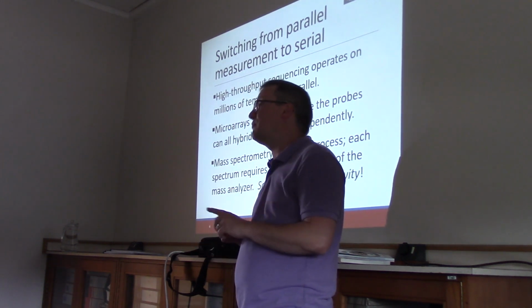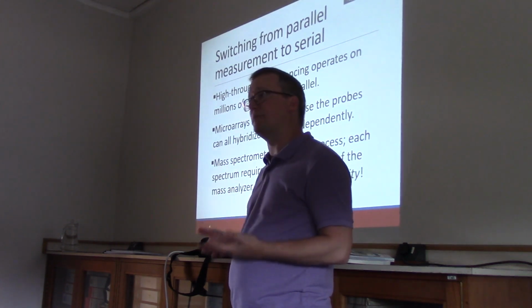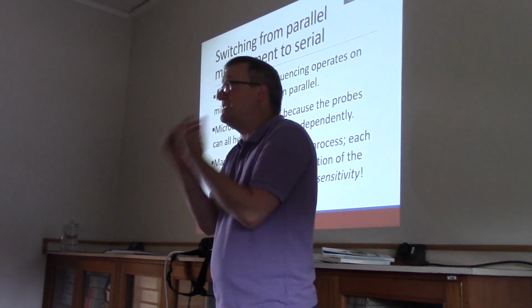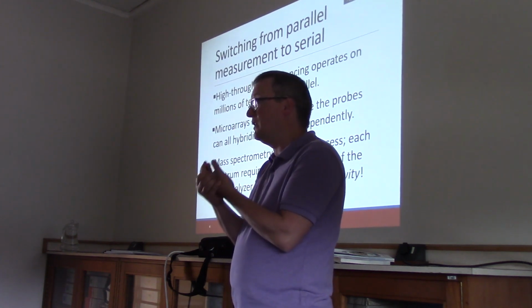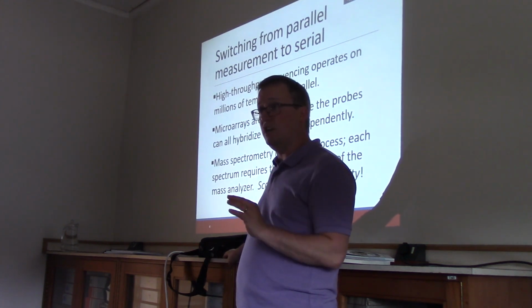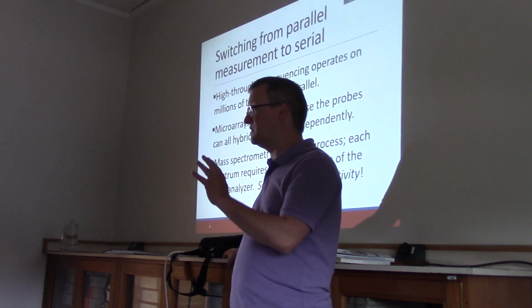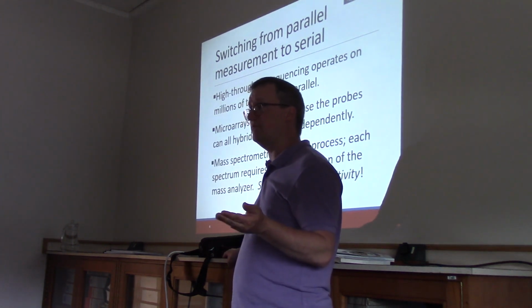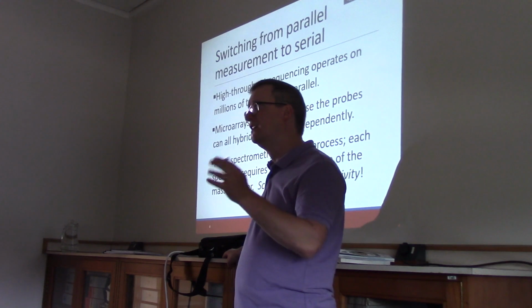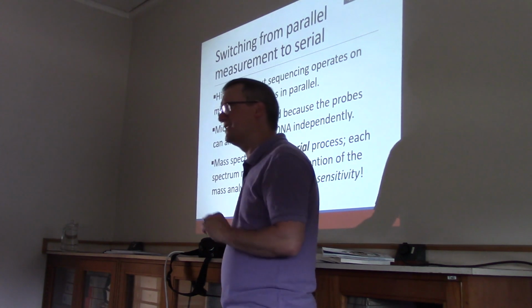Proteomics does not really operate in that paradigm yet. At present, almost all tandem mass spectrometry data is created by measuring, generally speaking, a single tandem mass spectrum at a time, where each tandem mass spectrum represents one peptide blowing apart. In recent years, we have seen some methods that attempt to quantify all of the peptides present at a particular moment of chromatography. But generally speaking, those types of experiments are not intended to identify all the different peptides of a cell at one go. Generally, those are about quantifying instead.